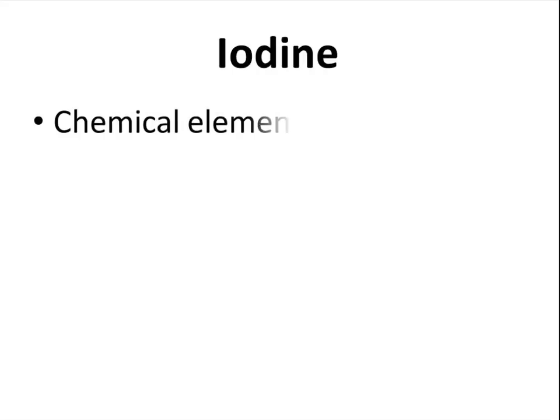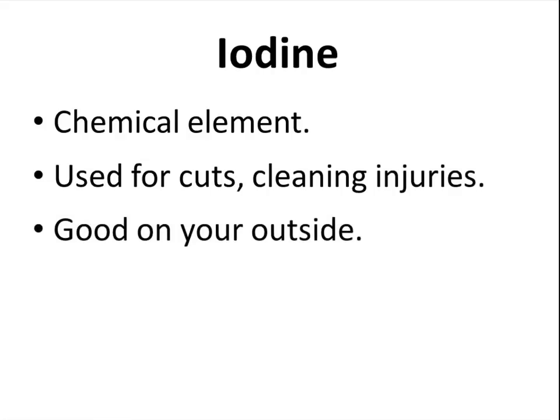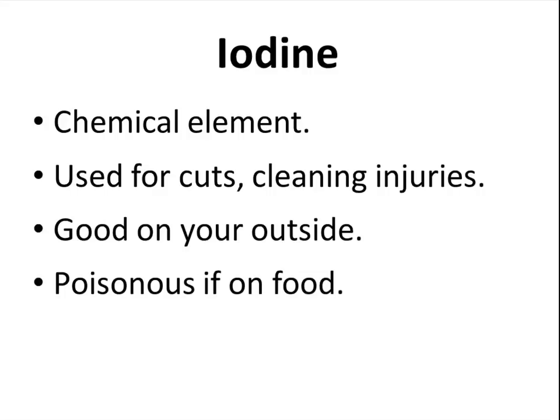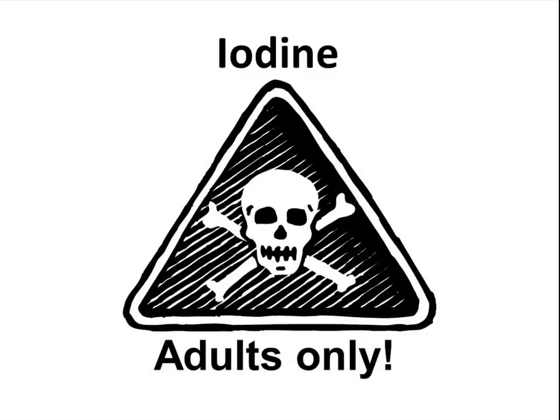Iodine is a chemical element. It is used for cuts and cleaning injuries. It's good on your outside, but it can be poisonous if on food — it is for adults to use only. Here is the little iodine we will be using in class, and you notice that it has a skull and crossbones on it.